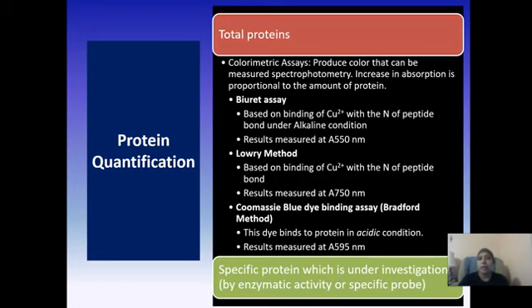Biuret method works under alkaline conditions, and while it's very linear and works very well in some conditions, it also has a lot of drawbacks. It can give this white precipitate, which can obviously mess up your absorbances, so you don't get a very good relationship. It also requires the samples to be boiled, and it's cumbersome, so it's not going to be the best one if you want to protect your protein samples at the end of the day. And it's not going to be very good at that quantification.